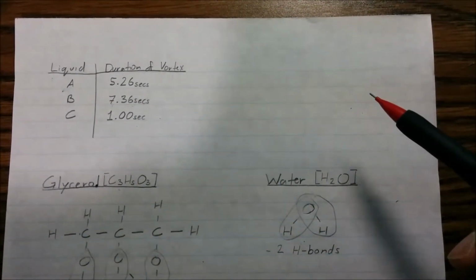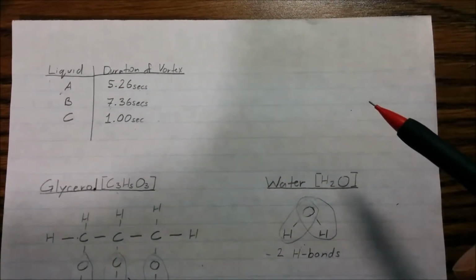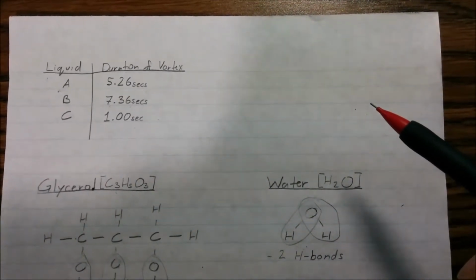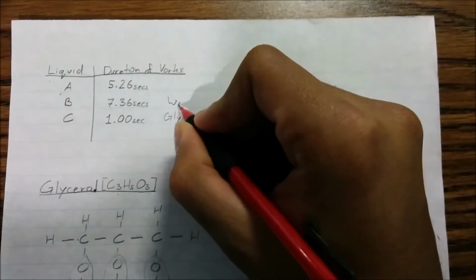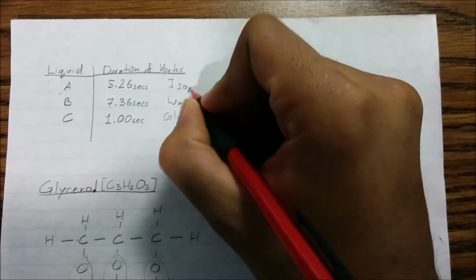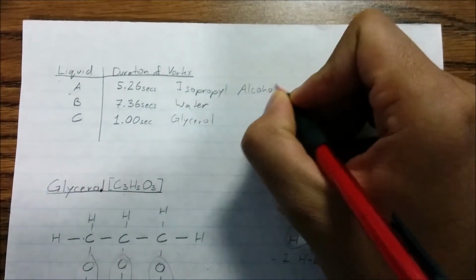The intermolecular forces in glycerol are so strong that the swirling motion is not strong enough to actually break the bonds long enough for the vortex to form. This means that liquid C has to be glycerol, liquid B has to be water, and liquid A has to be isopropyl alcohol.